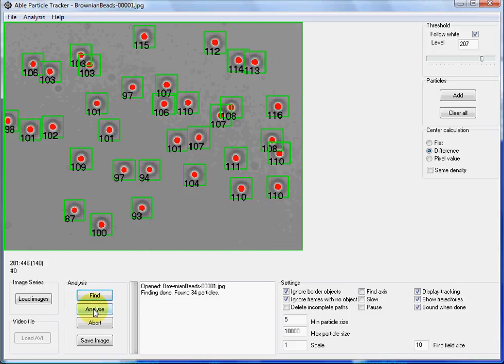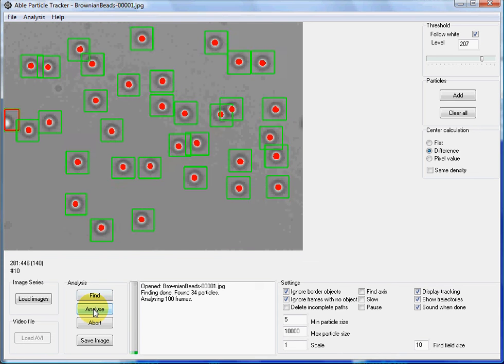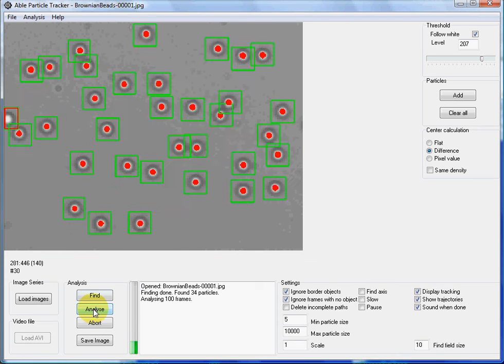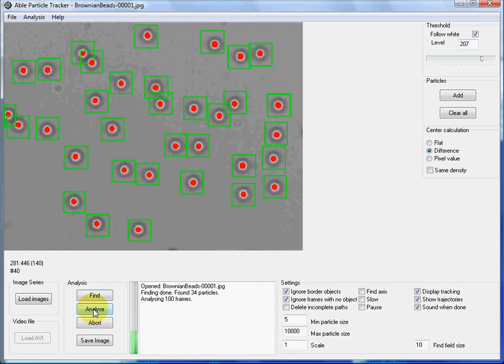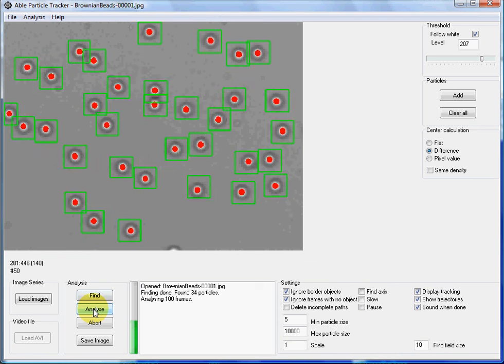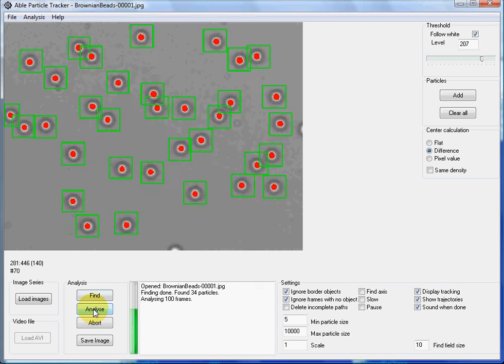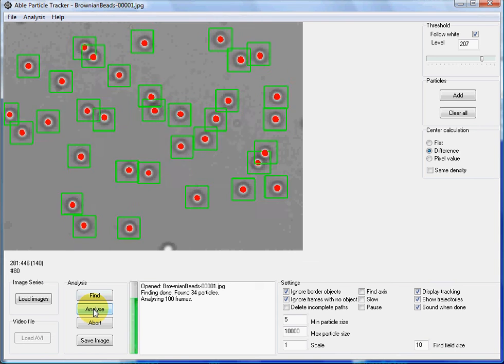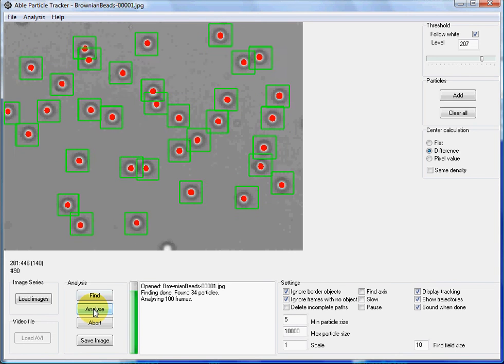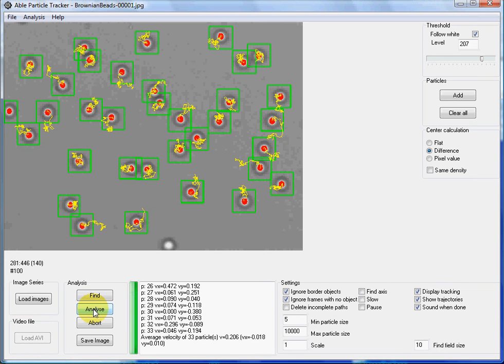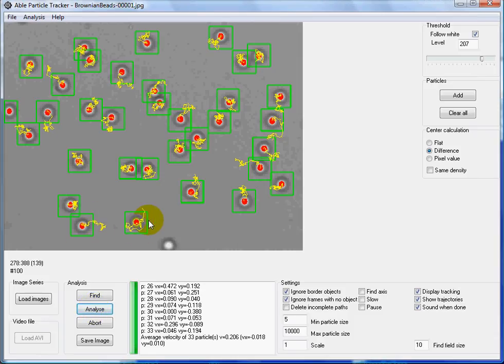And pressing analyze button starts the analysis. When the analysis is done the particle trajectories are shown in yellow.